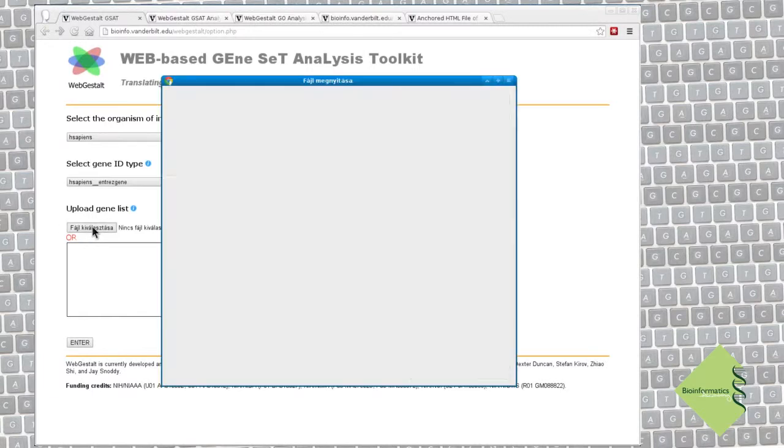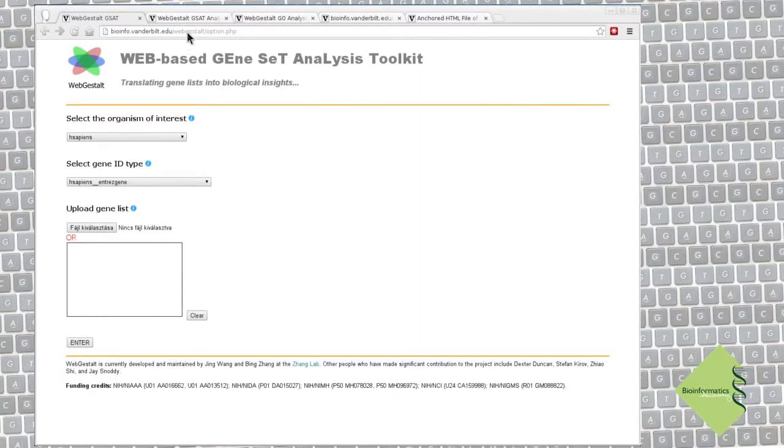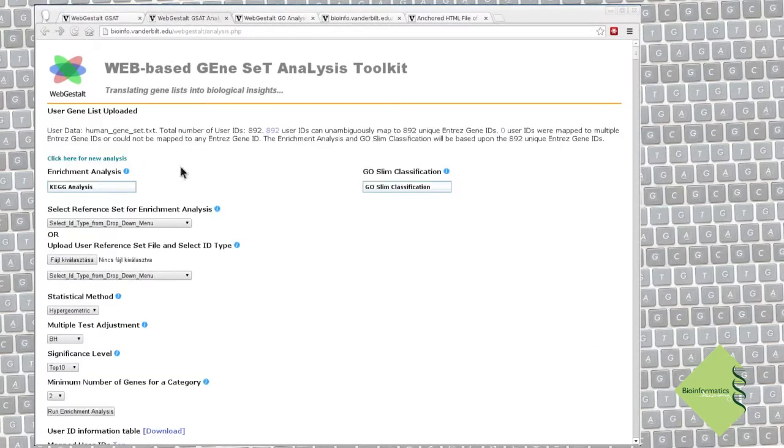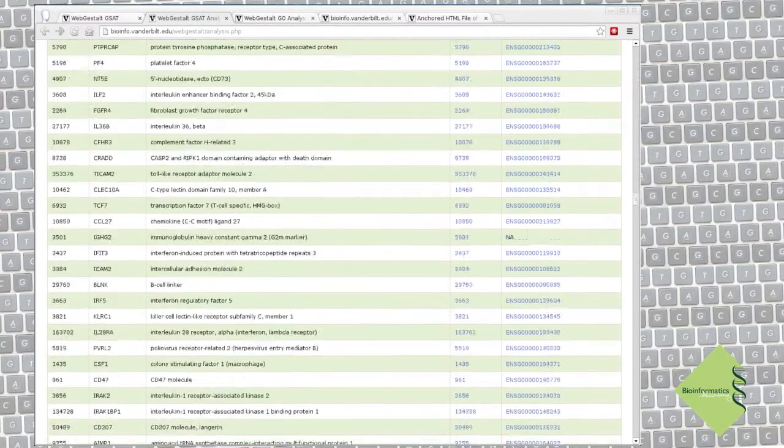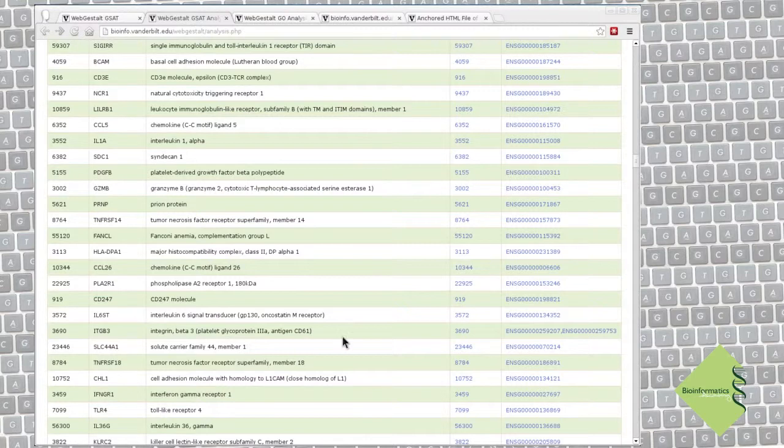Here we are at the main settings page. First, let's check if WebGestart recognized our IDs. Yes, we can see that it found annotation for all of these IDs. Good.